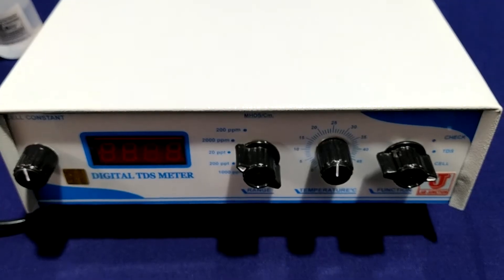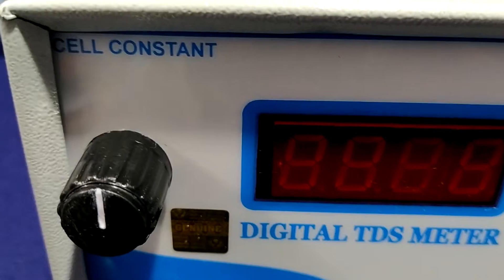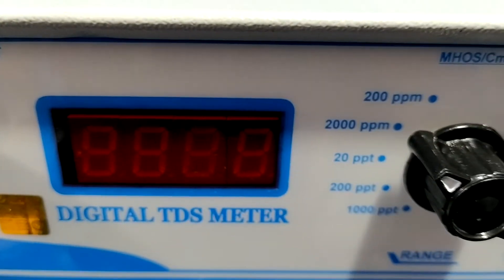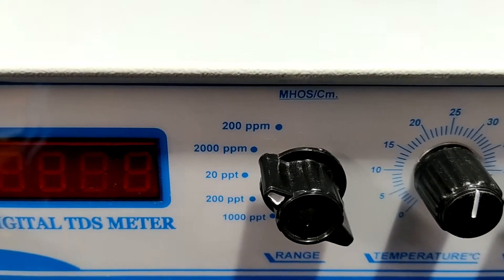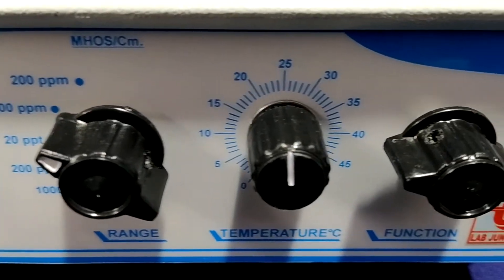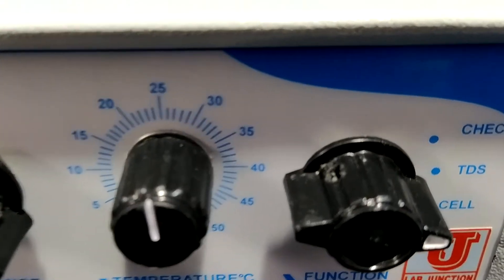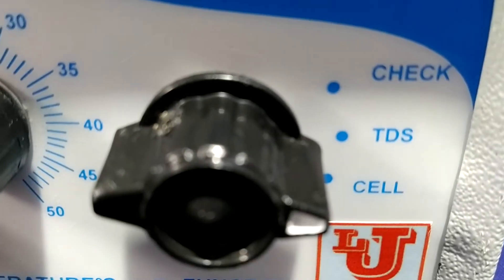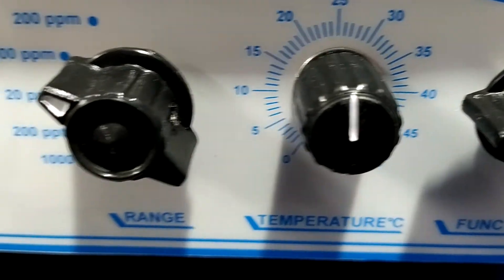This is the main instrument. In the front view, one function is the function control. In this function control, you can check TDS and cell constant facility. Next is temperature, and third is range.